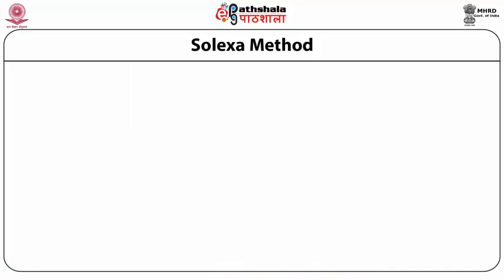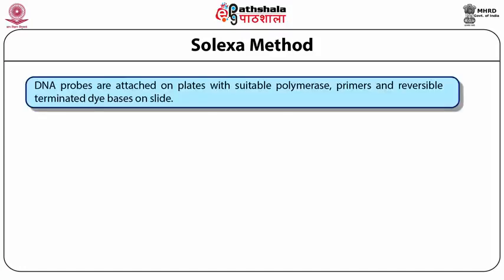Solexa method. Solexa, which is now part of Illumina, was founded by Shankar Balasubramanian in 1998. It is based on the principle that DNA probes are attached on the plate with suitable polymerase, primers, and reversible terminated dye bases on the slide. So we can say the Solexa method is based on the principle of reversible dye terminators.